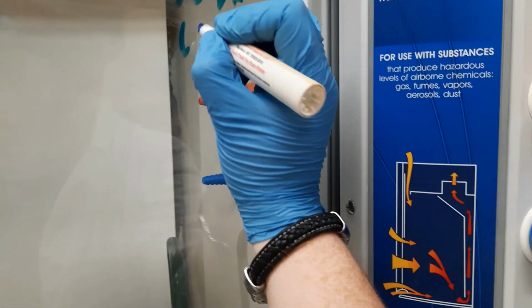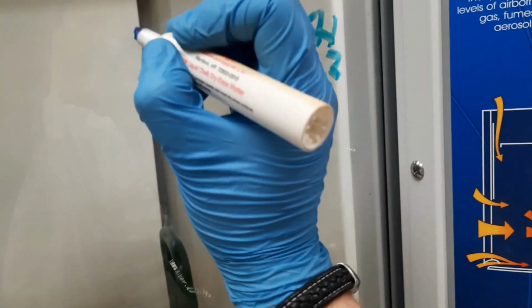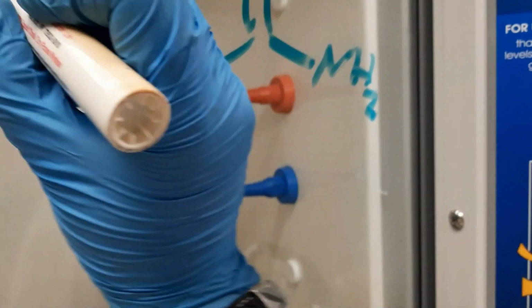I doubt it'll be a salt. It'll probably just deprotonate into our final product. I think that's what occurs.